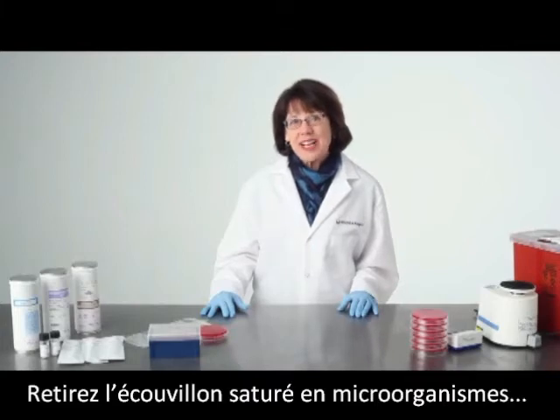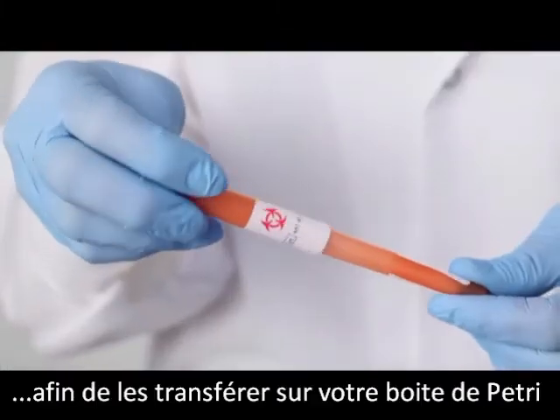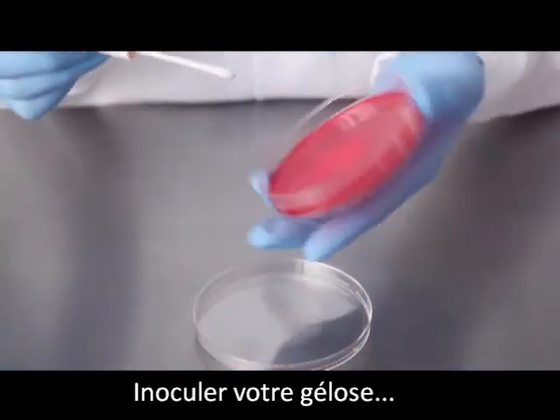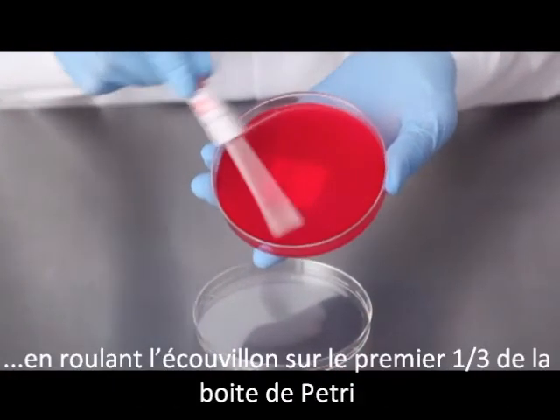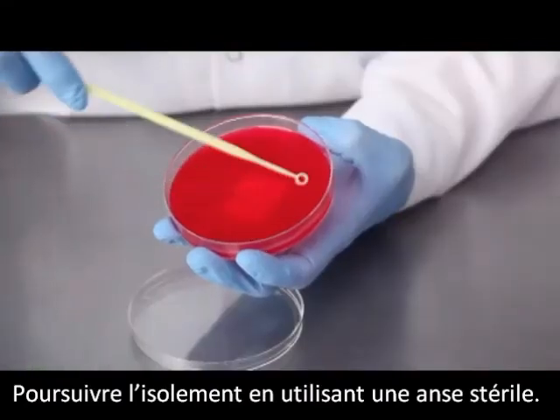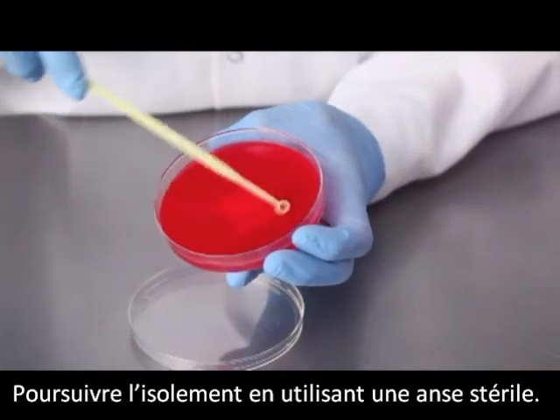Remove the cap of the device and use the swab to transfer the hydrated material to the agar. Inoculate the agar by gently rolling the swab over one-third of the plate. Using a sterile loop, streak to obtain isolated colonies.